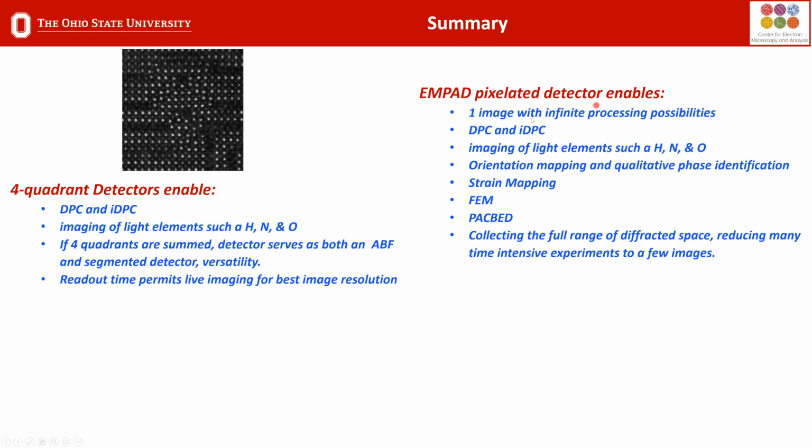For all of these measurements and techniques, one of the most important things we need is to know our thickness, and PACBED is wonderful at giving us an accurate thickness measurement. And so the EMPAD pixelated detector for collecting the full range of diffracted space is a game changer. It reduces many time-intensive experiments to just a few images, and now you can do it on a computer.